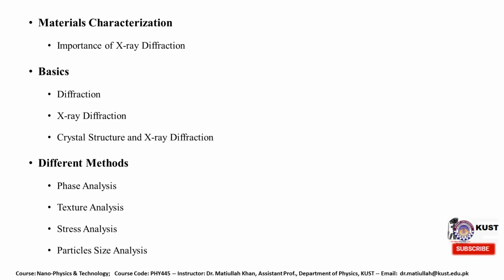and we often have some objective to perform the X-ray diffraction, just like phase analysis, texture analysis, stress analysis, or particle size analysis. So we will also be going through that.